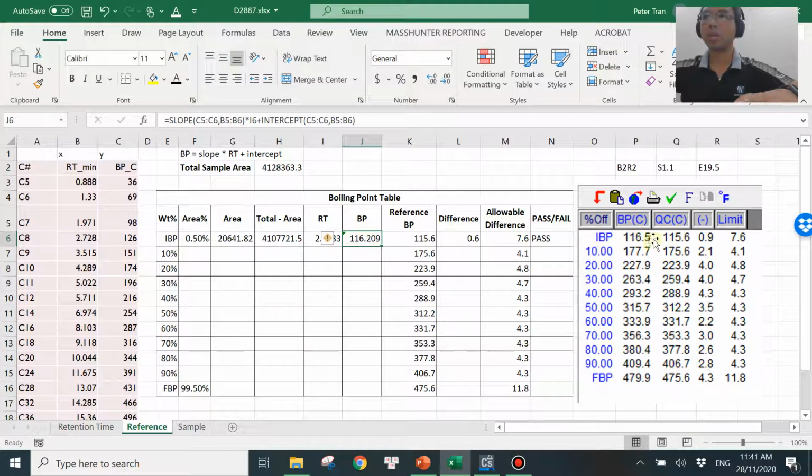So, but we are getting quite close. So I think that should be good enough for us to see, right? So let's pick one more, and I will show you how to perform. I don't know which one you like. So let me pick, let's say 40%. Okay. So how do you do 40%?